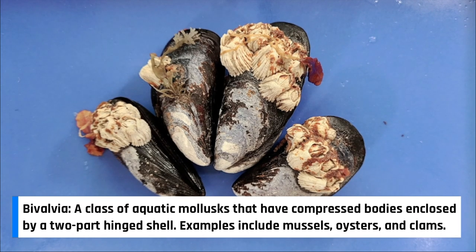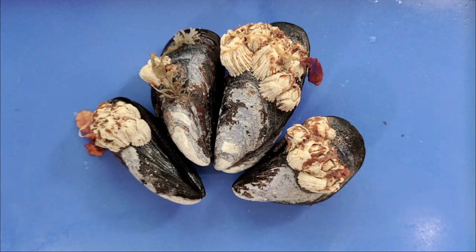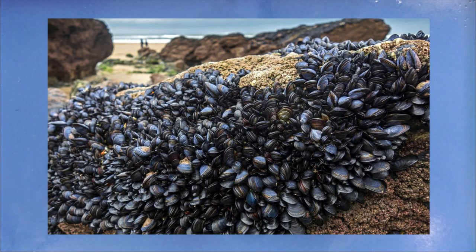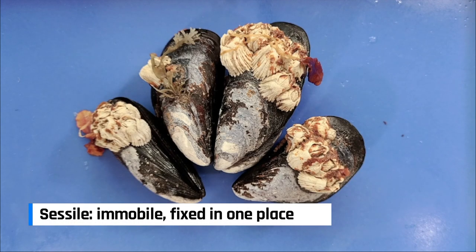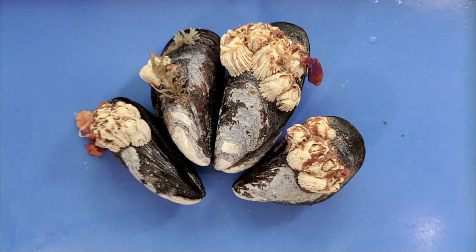Mussels are also part of a smaller group called bivalves, named as such because they have two shells. Mussels usually live attached to a rocky substrate and stay mostly sessile for the rest of their lives, which is why you see all these other animals and plant life that have grown attached to it.